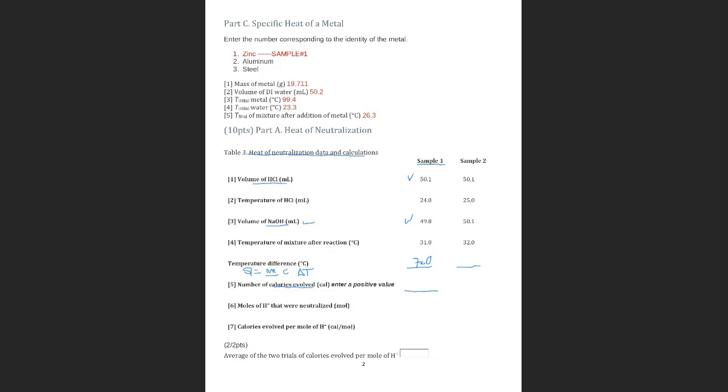So the total mass is going to be the mass of hydrochloric acid plus the mass of sodium hydroxide. So what would that be? 99.9. Okay, perfect. So you did a 50.1 plus 49.8, right? Yes, ma'am. Okay, awesome. So we have the mass.